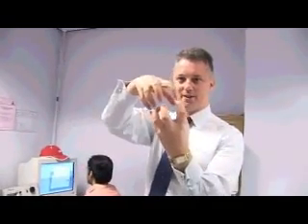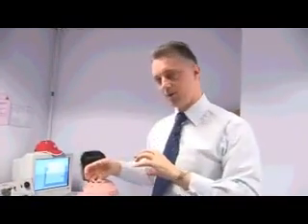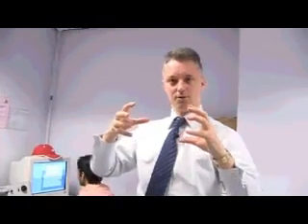What we're doing here is a slightly different experiment where, when I was saying we can measure the forces between molecules, that's what Mudasir is doing here. So what we do now is we bring two molecules together. So this is nanotechnology at its best. We're taking two molecules, we're bringing them together, we allow them to bind, just as would happen in our bodies, a sort of biological process, and then we pull them apart. And as we pull those two things apart, in this case it's a vitamin and a protein, we can understand more about the structures of the things as they bind. And that's one of the big questions in biology at the moment, trying to understand how molecules recognise and bind each other, and how the structure of those molecules helps us understand that.